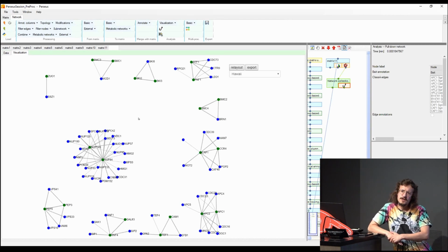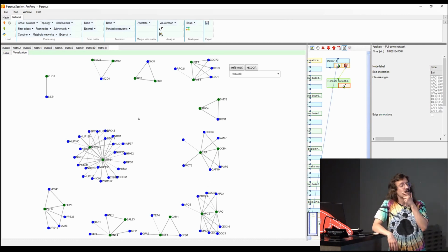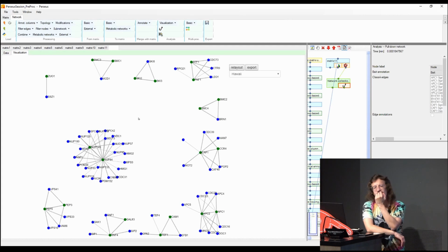Well, I would say that if you select two different baits with the same binding domain, then you should find the specific binder in both situations. So it shouldn't go against that. But you're right, then it will. Yes, because the other sample would be in the complement, when you are analyzing one particular one.